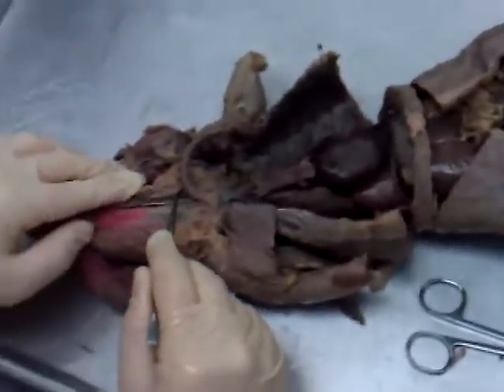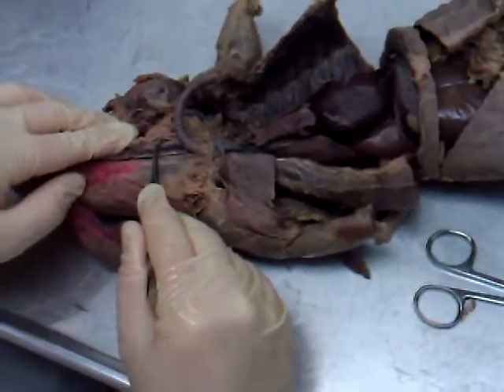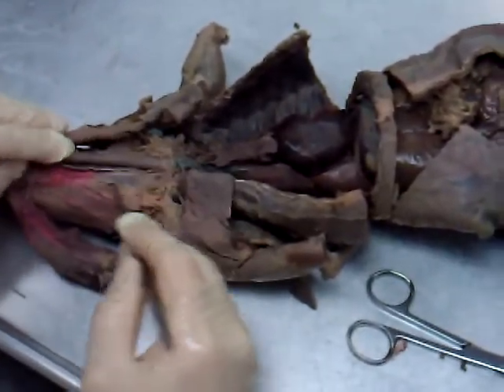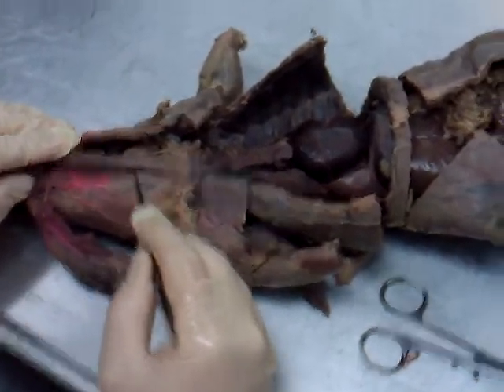The artery right beside it is the left common carotid artery. The vein, if it was intact there, would be the left internal jugular vein. On the outside, the vein you see going out in this fashion would be the external jugular vein, but it doesn't show as well on this mink.